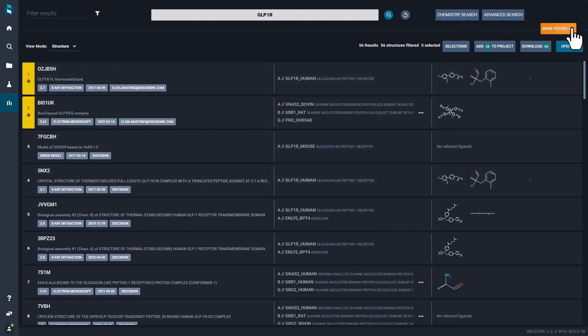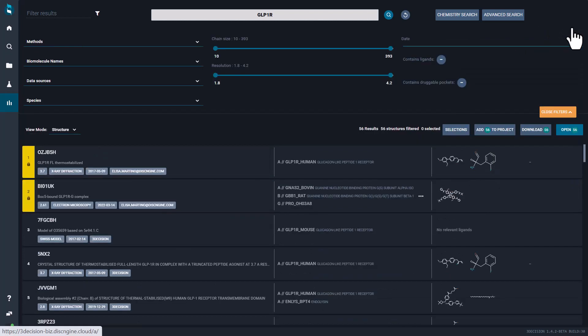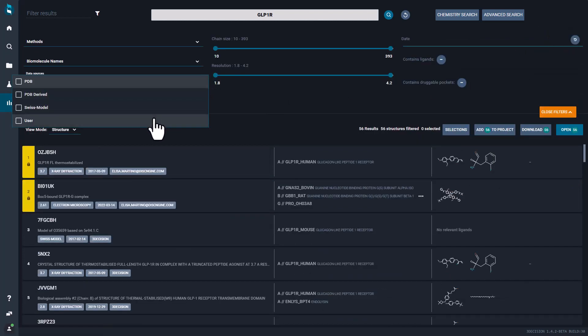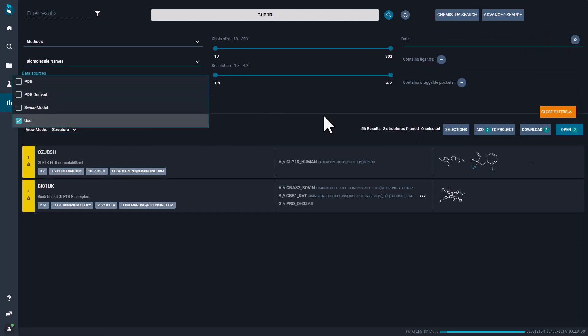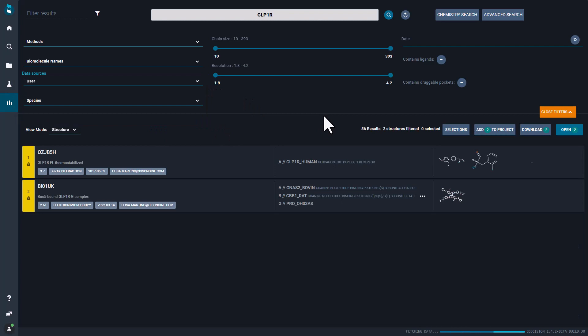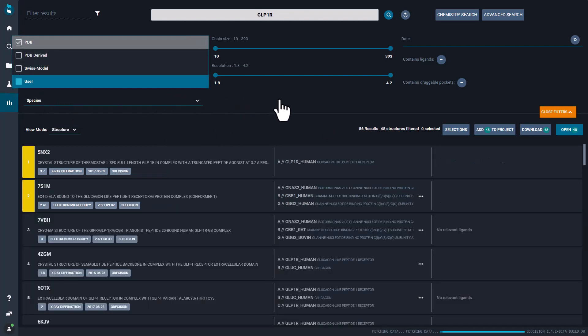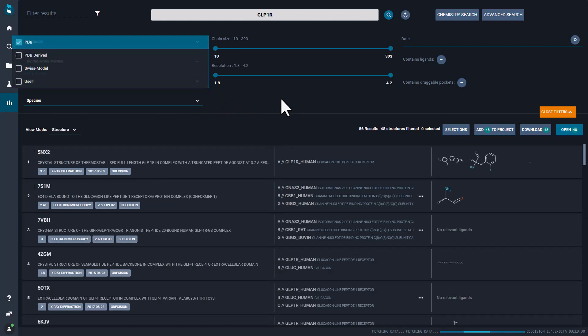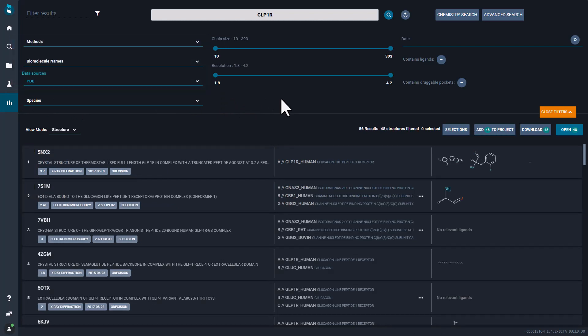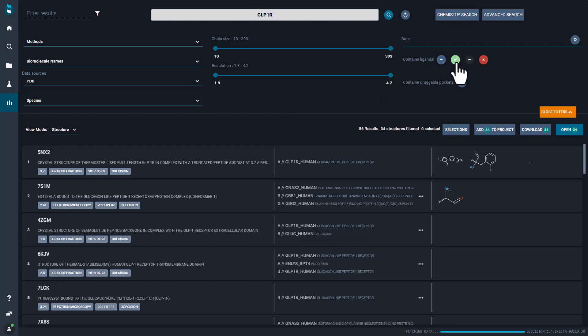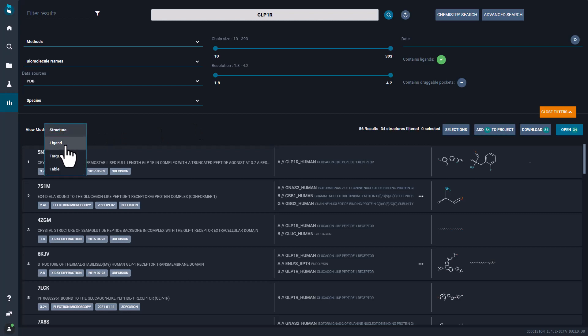You can easily refine your search with post-search filters, for example selecting only your proprietary structure or only the one from the PDB databank. You can also choose only structures that are in complex with a ligand. You can switch to the ligand view mode to focus on the chemical matters.